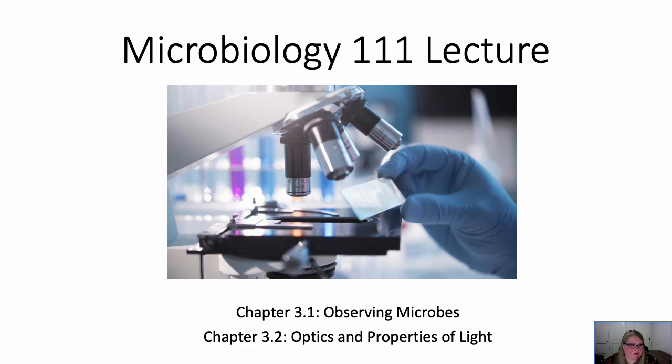Okay, welcome to chapter 3. So, chapter 3 is really cool. This is actually one of those chapters that we use a lot, not only in class, but also in the lab. So, chapter 3 is all about microscopy and how we observe microbes in the lab.